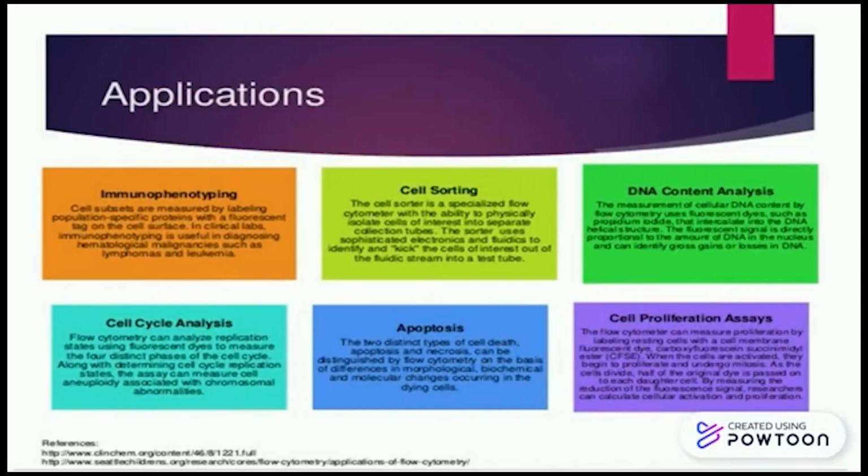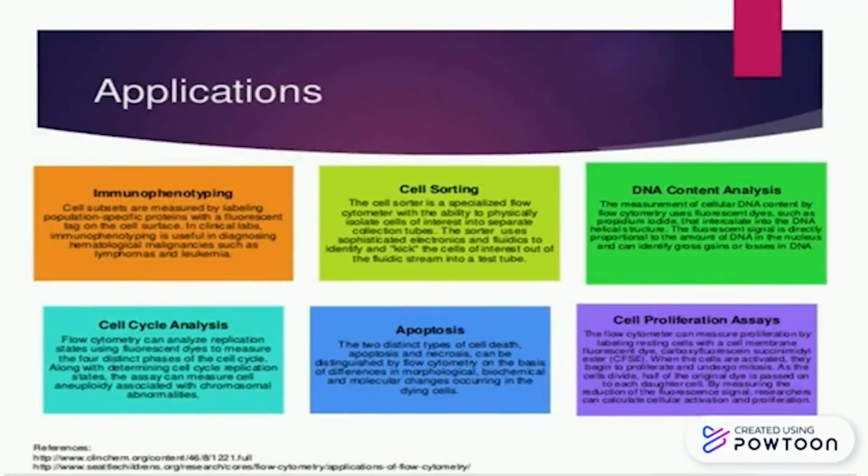There are several applications for flow cytometry, such as immunophenotyping, cell sorting, DNA content analysis, cell cycle analysis, apoptosis, and cell proliferation assay. And the most common uses for flow cytometry are DNA content analysis, cell sorting, and cell cycle analysis.